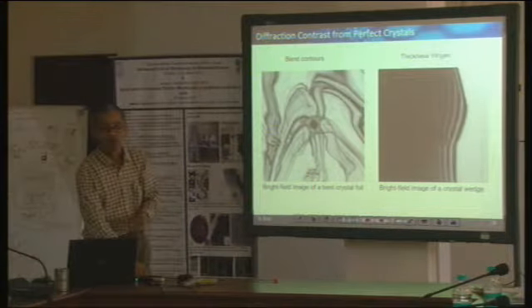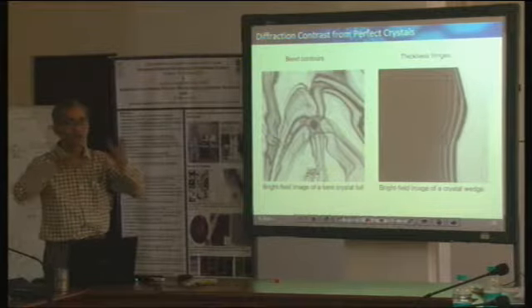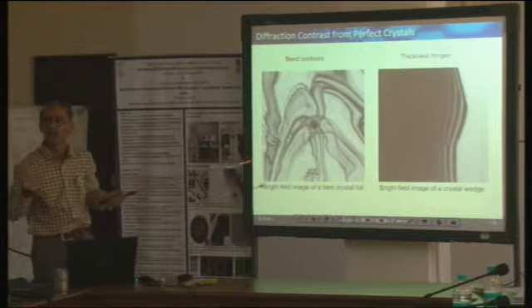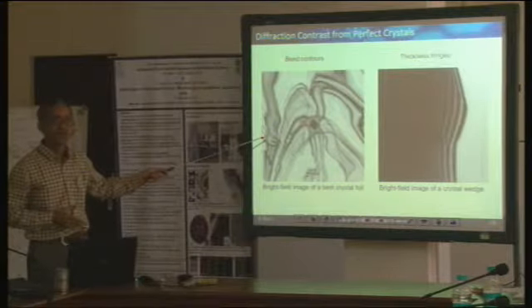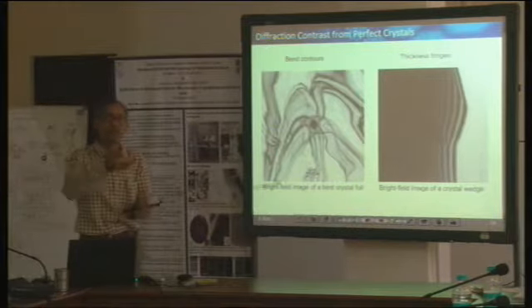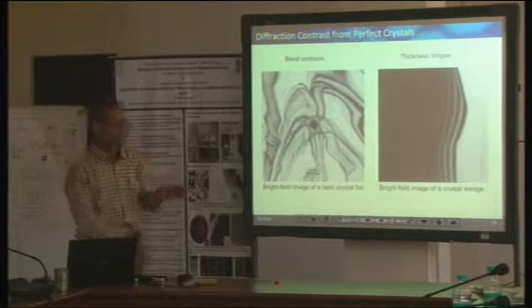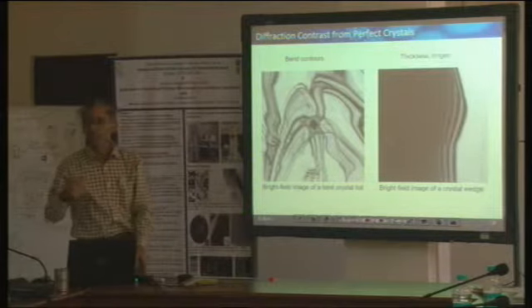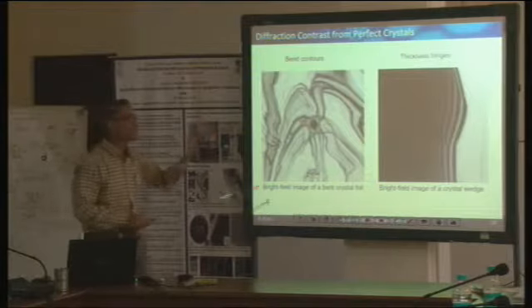Now this silicon happens to be single crystalline, so it's perfect. No defect should be there, but we are still seeing an image like this. This is strange: when there are no defects, why should there be such an image? It actually has to do with the bending. Because my sample is not uniform, it has got bend, which can happen to any sample, and since it is bent, my Bragg diffraction condition is sensitive to that bending, and that's the result of it. We will see it in more detail.